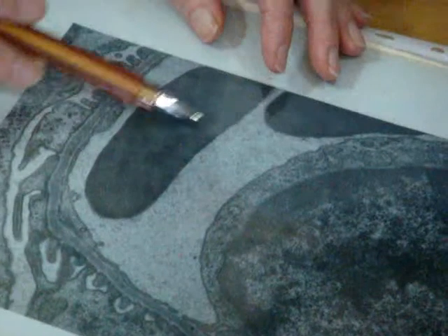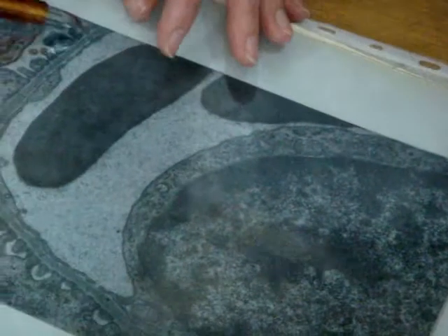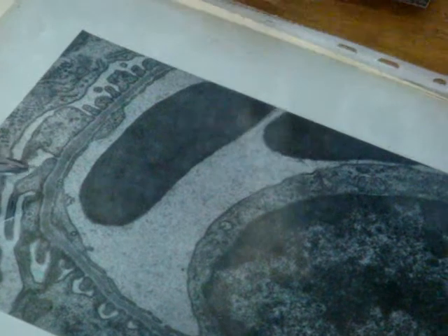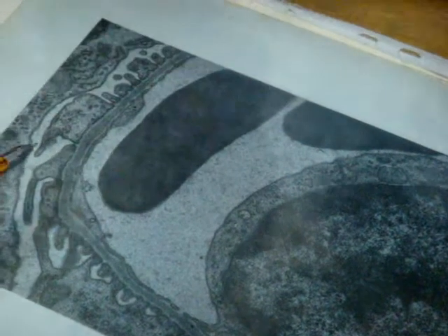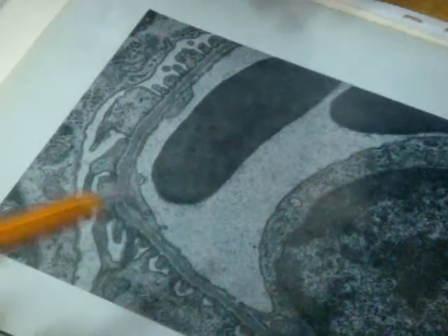In the lumen we can see what? An erythrocyte. This is the nucleus of an endothelial cell. And the basement membrane is common to the blood vessel and to the podocyte. That's why it's very thick. And these are the pedicels of podocytes. So this is the barrier. Do you have a question?